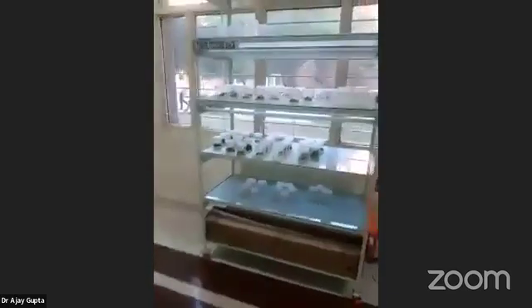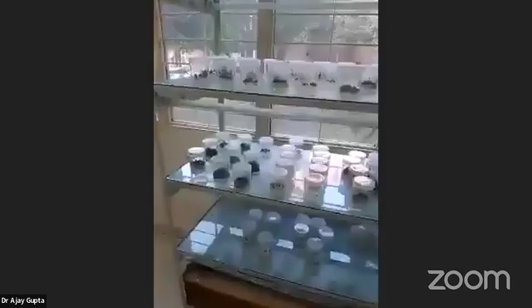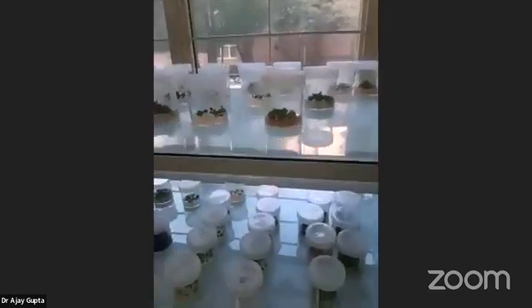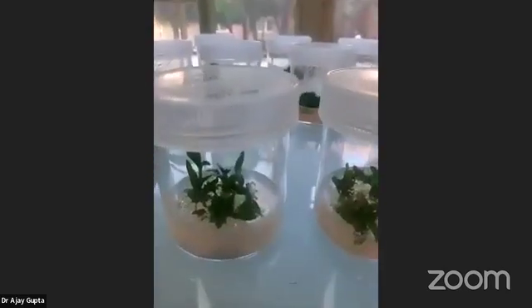Once this is done, the plants, all the cultures, have been transferred. Now you can see we have to keep them here for some time. Earlier they are kept like this, a very thin population, and once they grow, you can see the dense growth.